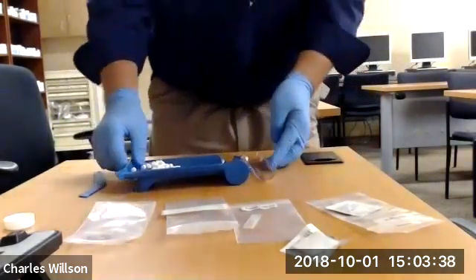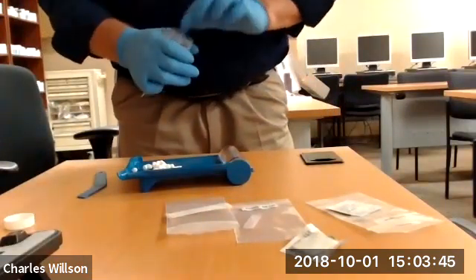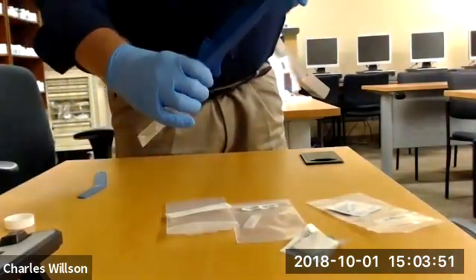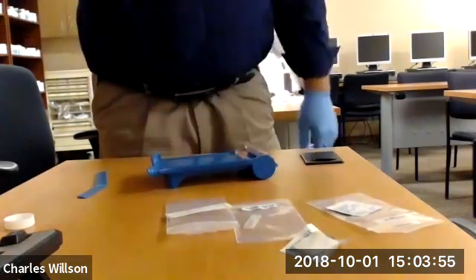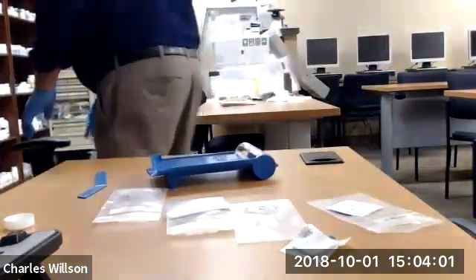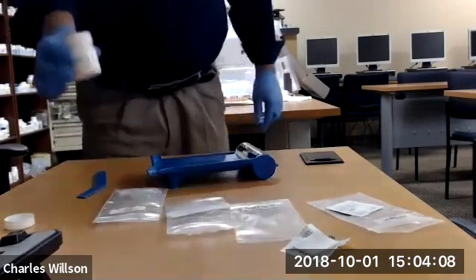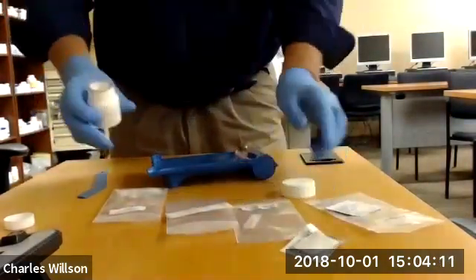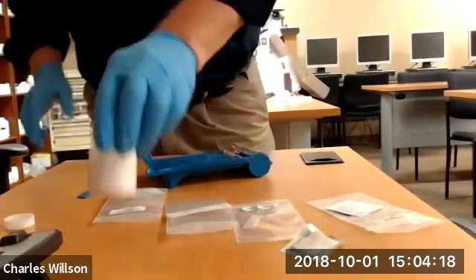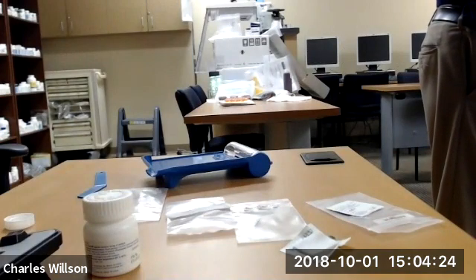Okay, and then what you do is you close the well, if you will. Okay, you take the extra tablets and pour them back into the stock bottle. Now, normally, I mean, it's rare you find anybody keeping tablets in a Ziploc bag. It's going to look more like this. So you open the lid up and you pour the tablets back in there, and that's more realistically what that would look like. But okay, this is what we're doing. It's an experience. It's a laboratory experience.